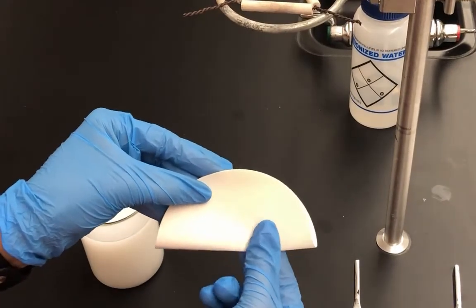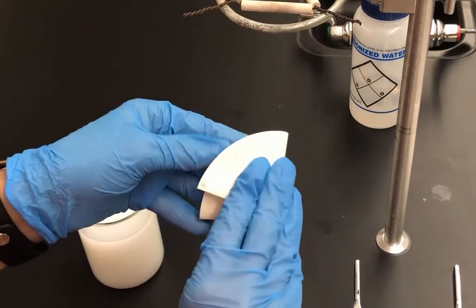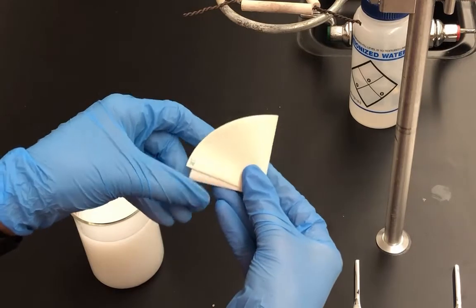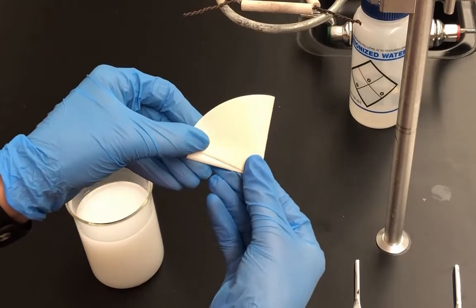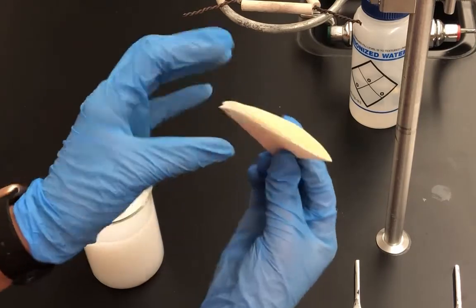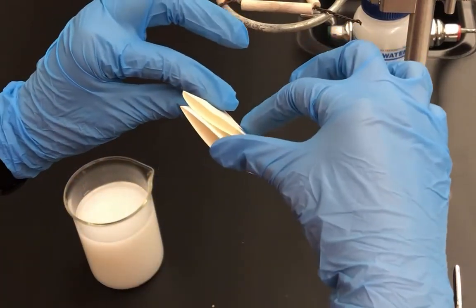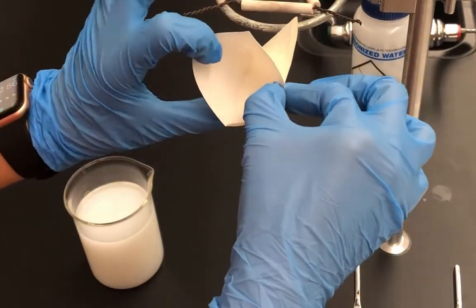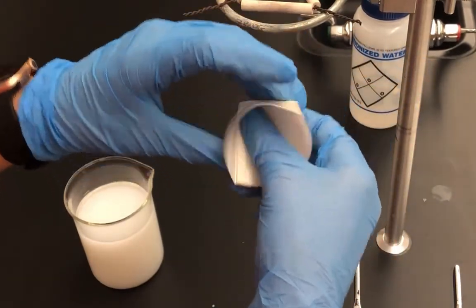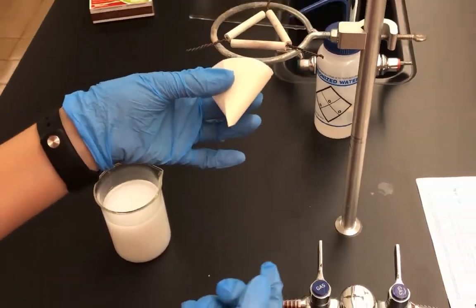We fold it in half, and then fold it in half again. Now I'm not going to fold it exactly in half. I'm going to leave this little lip. When you open the filter paper, you'll notice that you have 4 pieces. You take 3 pieces on one side, 1 on the other, and then you have your cone for filtering.